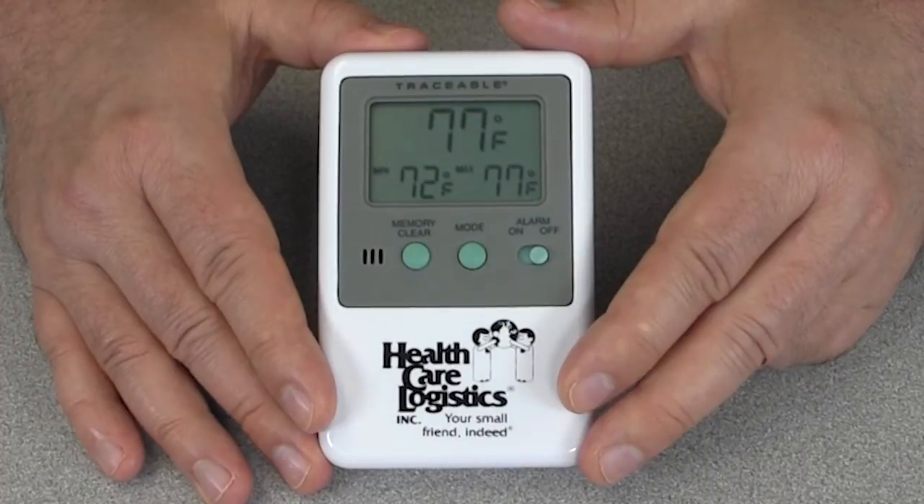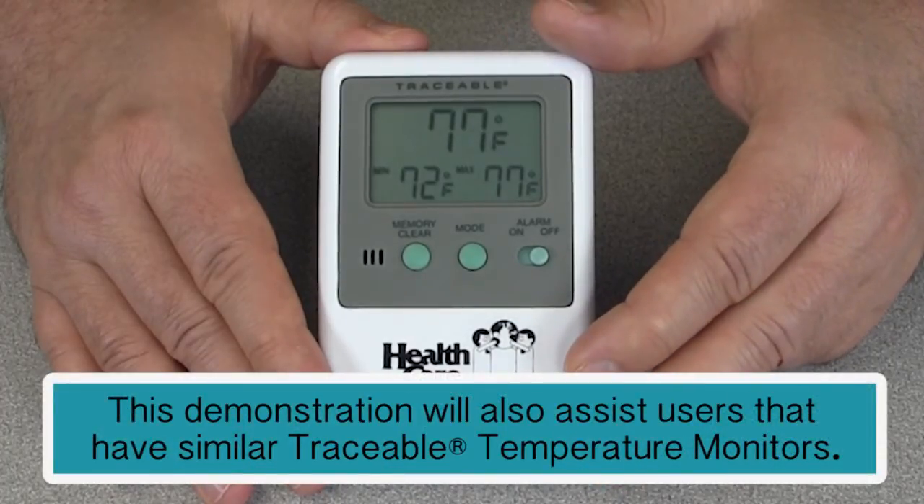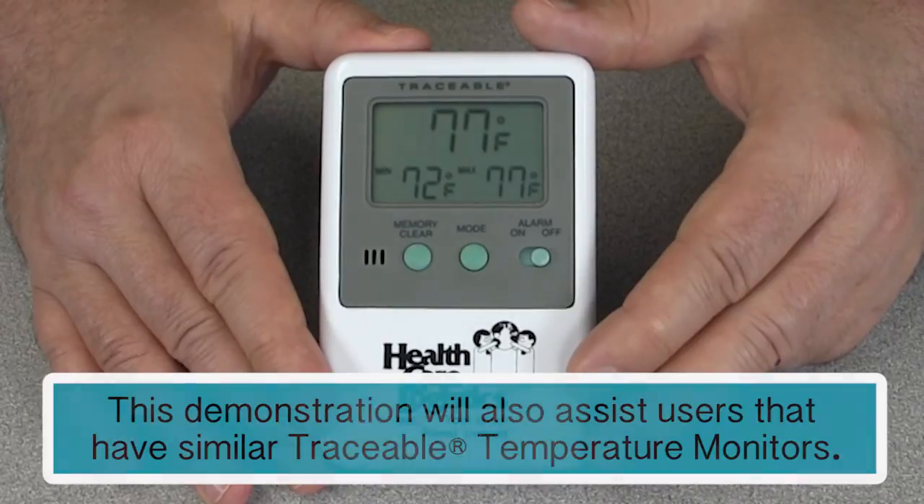Hi, this is Eric of Healthcare Logistics and I would like to take a few moments to demonstrate for you how you adjust the alarm settings and how you clear the temperature readings from your traceable temperature monitor.